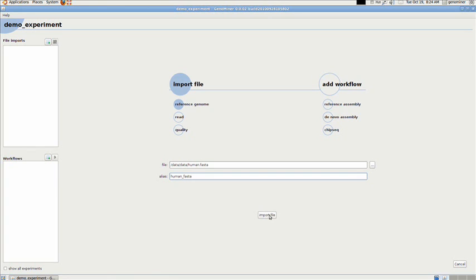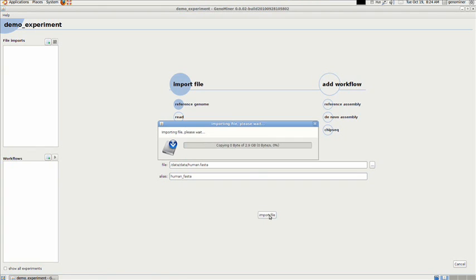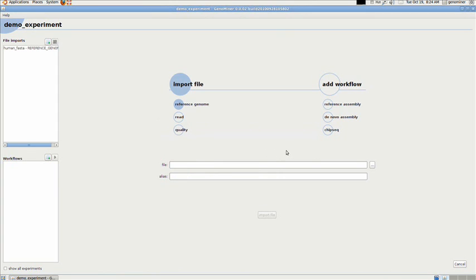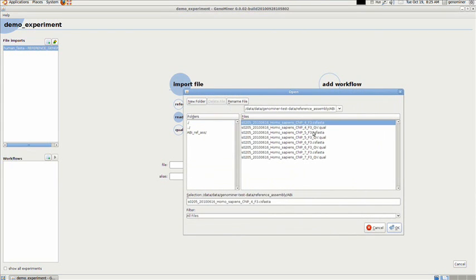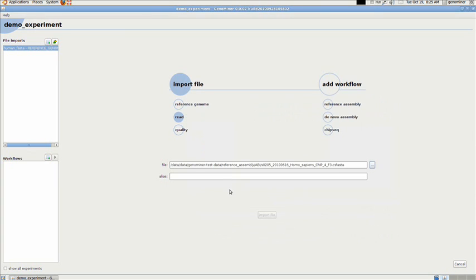We have found it essential to give the possibility to rename the input and reference files on demand. The upper window on the left lists the successfully imported files. As we can see, the file is designated with the name given by us and the type of the file. Then files containing the reads, CS/FASTA, and quality values, qual, are needed. We follow the same protocol as before.